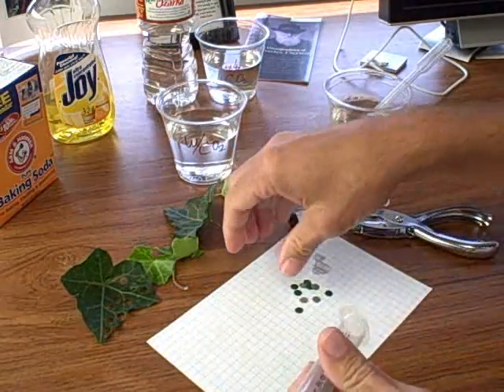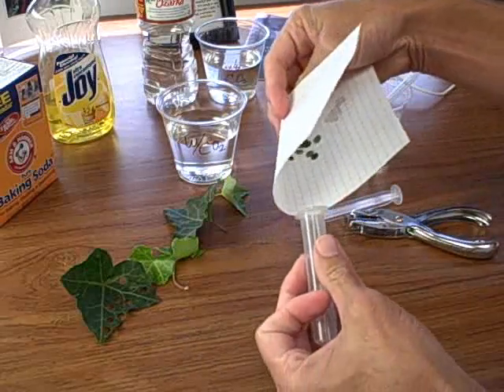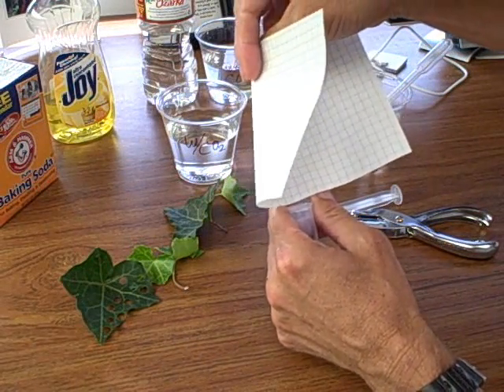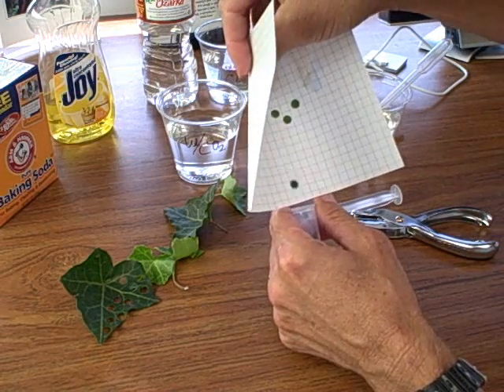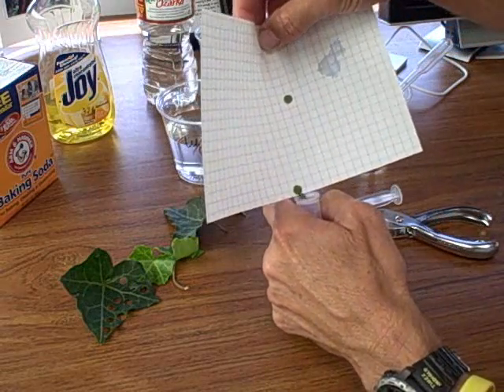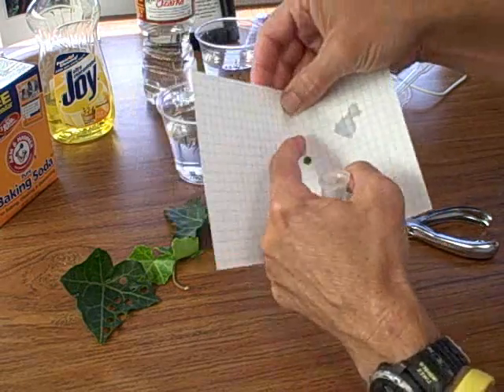I'm using ivy, but it really doesn't matter whether you're using spinach or ivy — the procedure is the same. In fact, it's easier to get spinach leaves to sink because they don't have as much of a waxy cuticle. I'm going to put 10 discs in here.